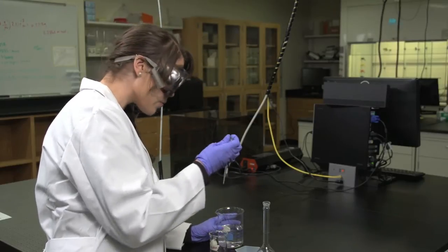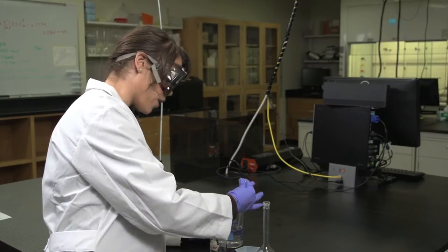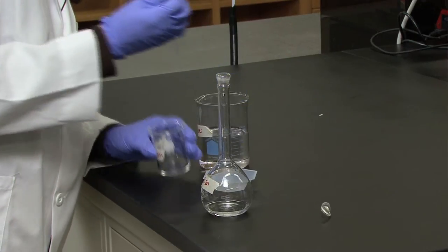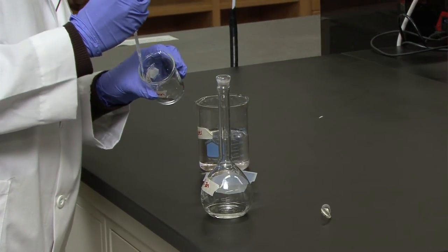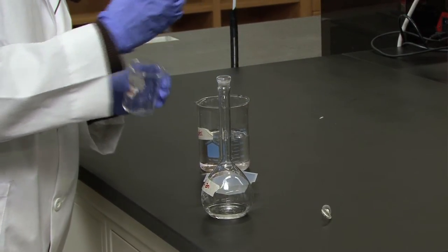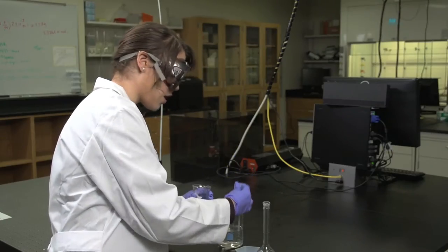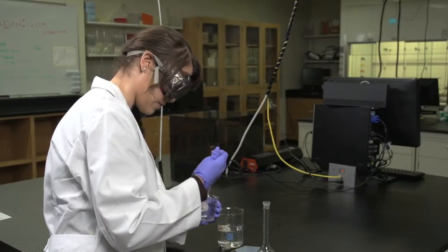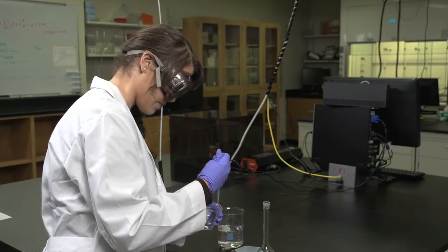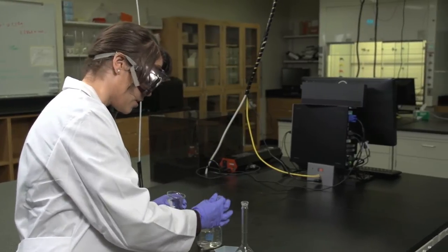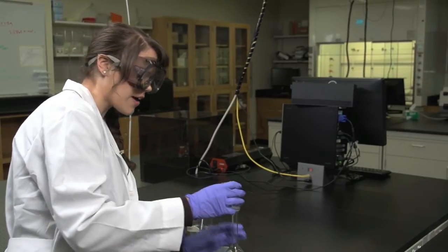I'm going to now rinse out my beaker with some water. I'm trying to squirt the water along the sides of the beaker to make sure that I have fully transferred all of the dissolved zinc. You want to do this step at least five times.